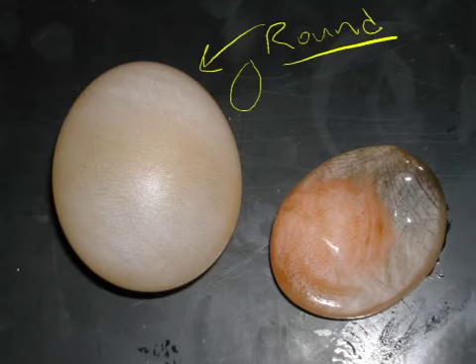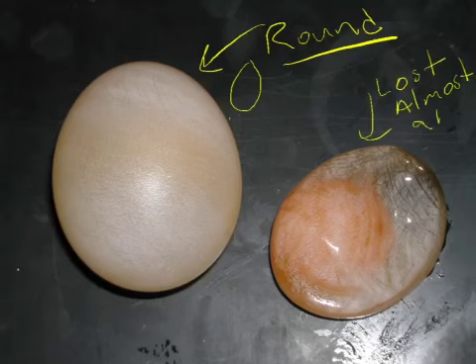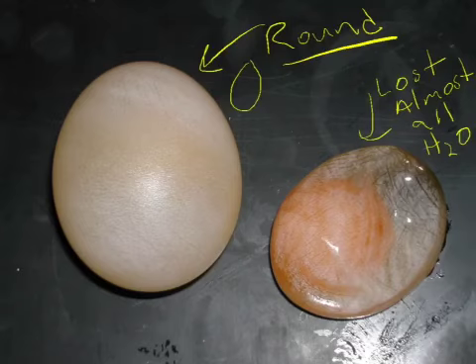This is much more round than it would normally be. Of course, this is almost completely void of all water. It lost almost all its water. That's intense. And that loss of almost all the water inside the egg has flattened it out.